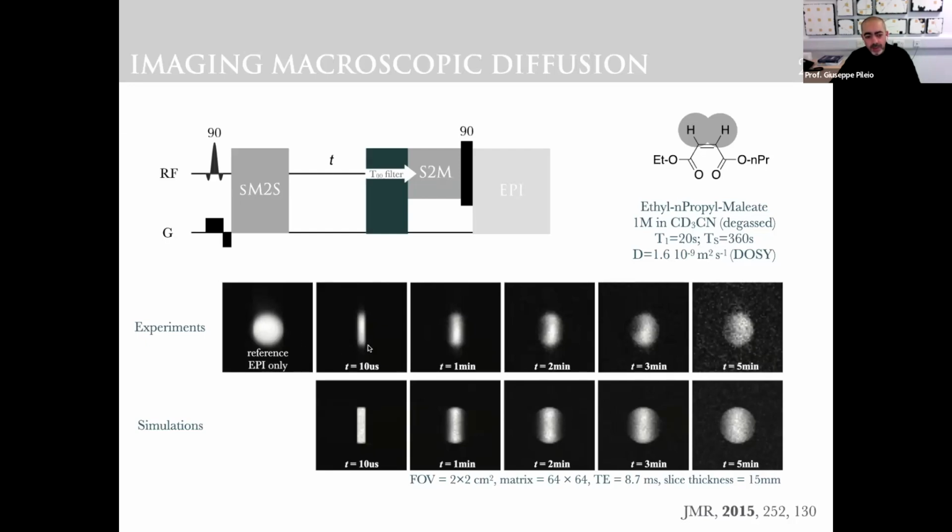Okay. Then if you do one of these experiments in which tau is essentially 0, then you can see the slice, I think a 3mm sagittal slice, that I selected in this experiment in the first part of the sequence. Now, obviously, in that much time, microseconds, the molecules haven't moved significantly. So when you come and take the image, you just see the molecules in the original slice.